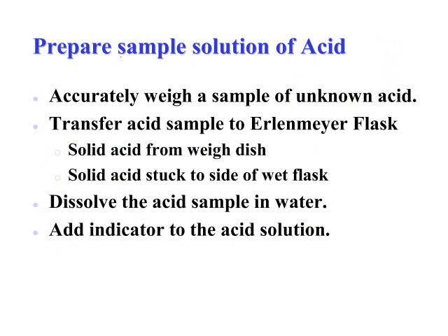To prepare your acid sample, this time you're going to use the analytical balance, so everyone needs to take their turn using the analytical balance, and you're going to accurately weigh out a sample of your unknown acid.